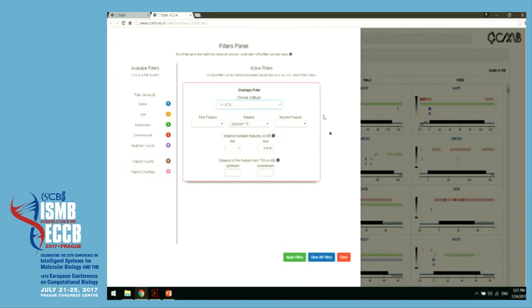So features here being the histone marks, and you can ask which genes meet that particular criteria, right? For example, I want to filter all the genes which have a bivalent mark near the promoters. We know that K4 methylation overlapping K27 methylation is a hallmark of ESCs, so we expect some genes to have this. So I choose my first feature as K4 trimethylation and the second feature as K27 trimethylation.